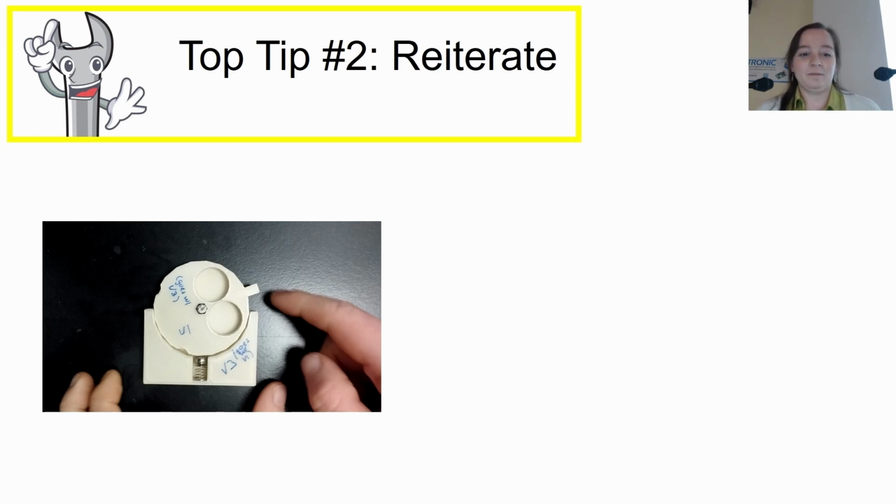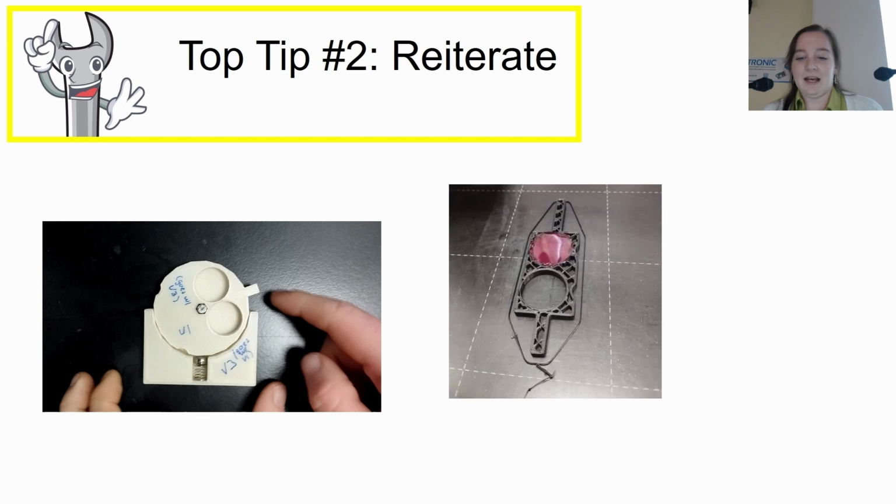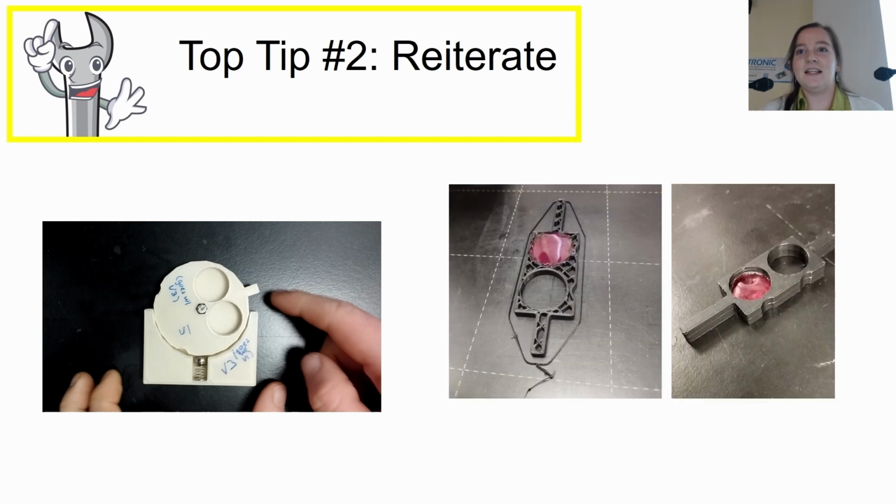So then we moved on to this ball bearing mechanism where you can move the filter into place. And you'll see that each time you do a design, it will just get simpler naturally. Sometimes our first instinct is to overcomplicate things, but every time you do it again and again, it will get simpler. And eventually my design for the filter changer ended up like this, which is much simpler, easy to 3D print, and you just put the filter under those little notches.